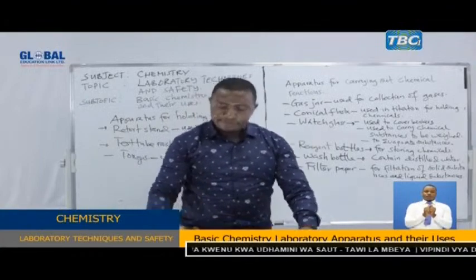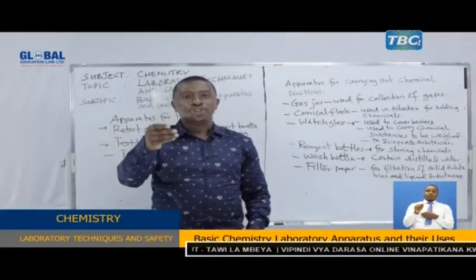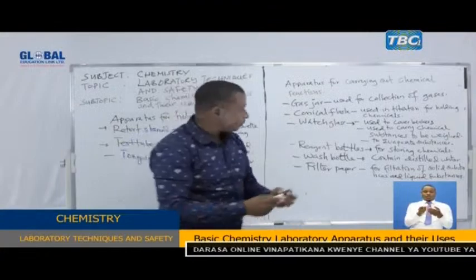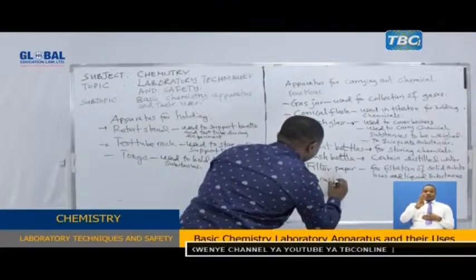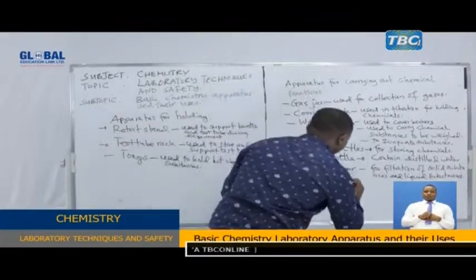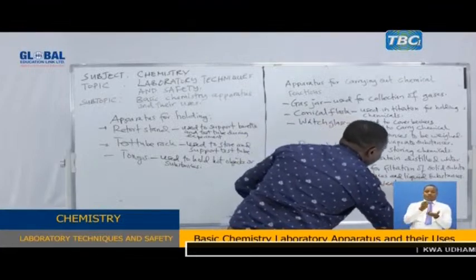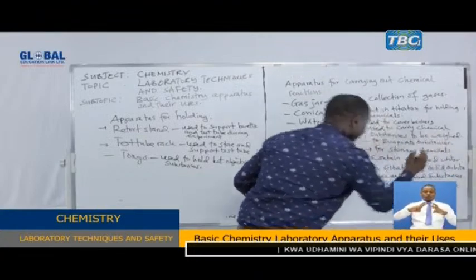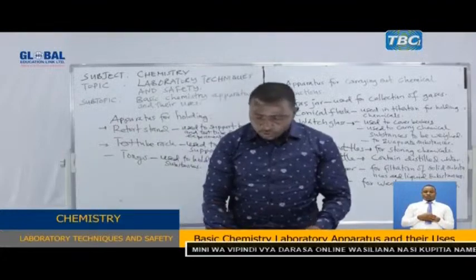We also have a brush, a test tube brush. This one is for washing apparatus used in the experiments. Washing apparatuses used for experiments.